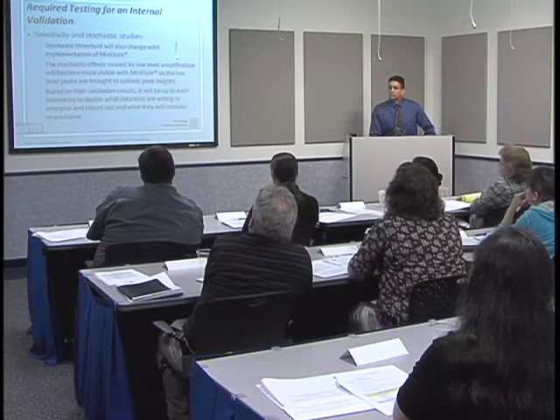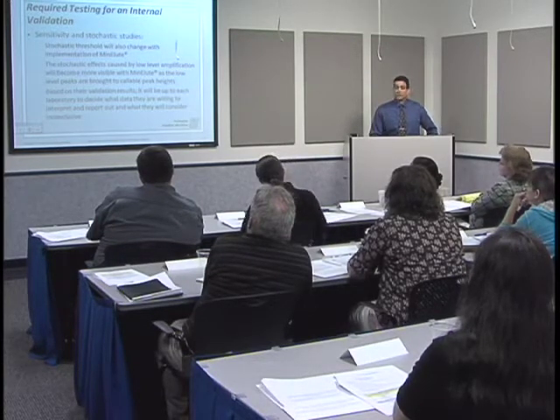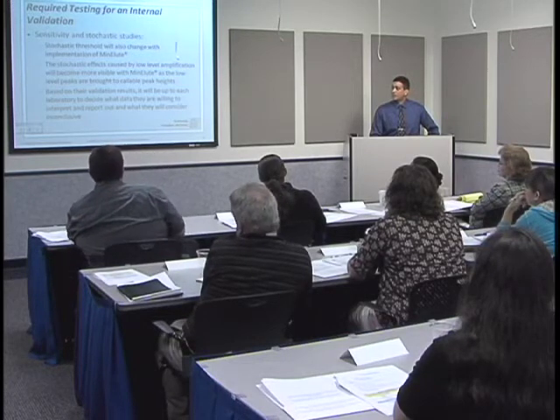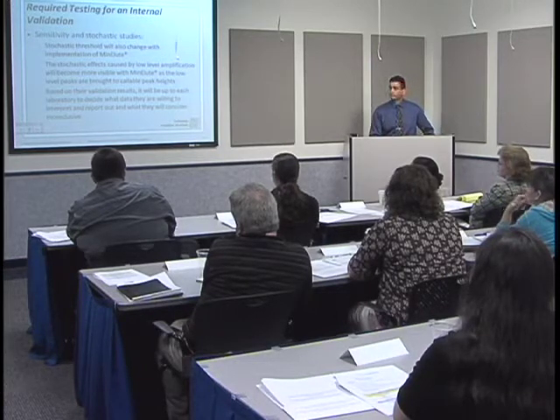Stochastic threshold will also change with implementation of MinElute. The stochastic effects caused by low-level amplification will become more visible with MinElute as the low-level peaks are brought to callable peak heights. Based on their validation results, it will be up to each laboratory to decide what data they are willing to interpret and report out, and what they will consider inconclusive.